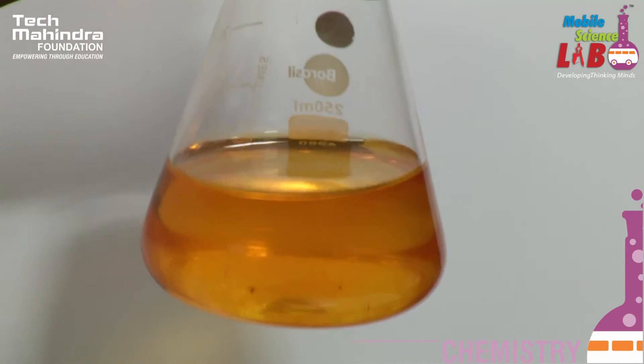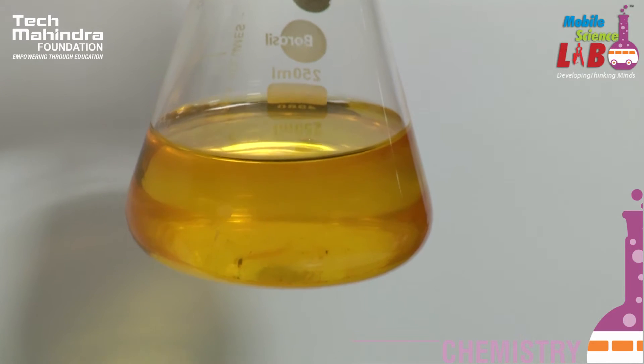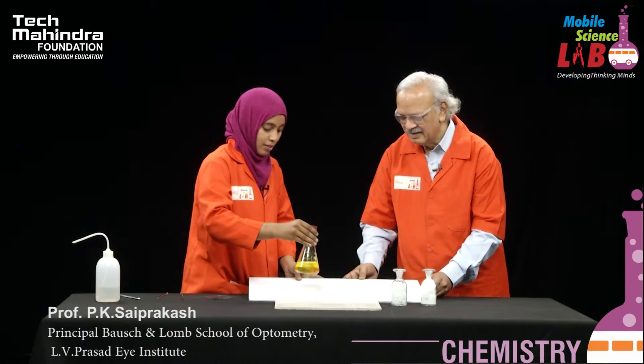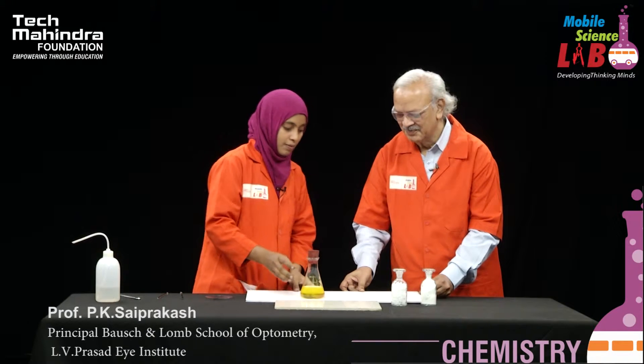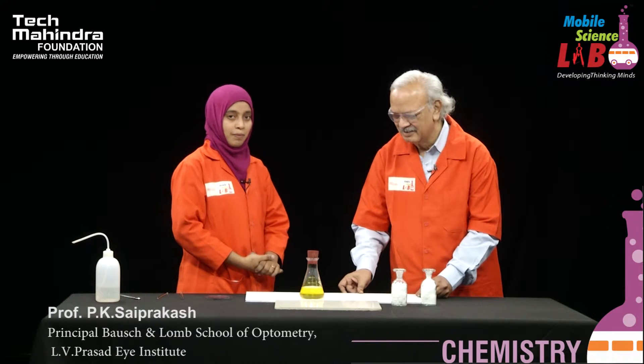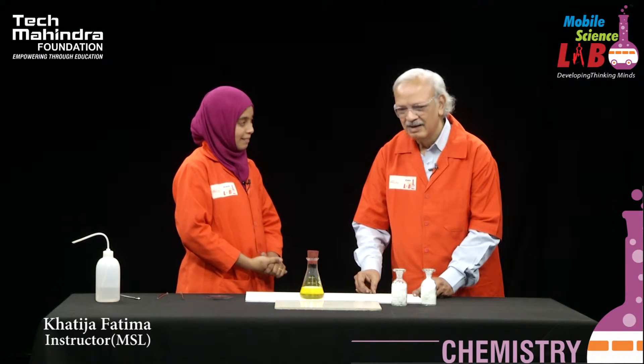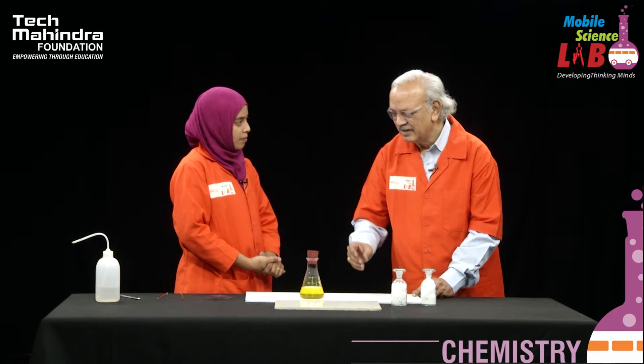It's coming — green again! Okay, it is a very fascinating experiment, the traffic light experiment. Students and teachers enjoy this in class. Because of the various oxidation states, you get the different colors.